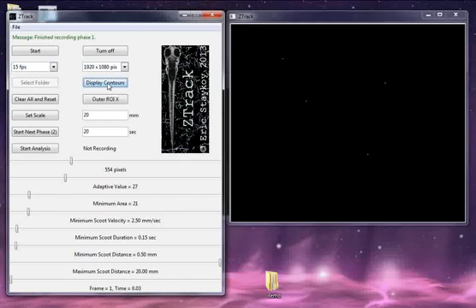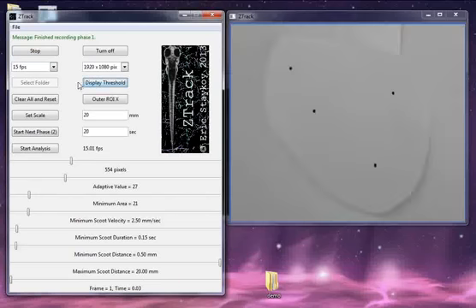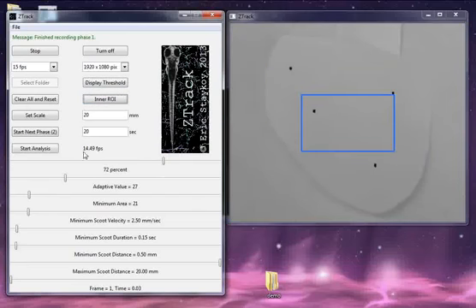Once the recording is finished, you can see a virtual representation of it by using this slider here at the bottom. I just realized that something I didn't show was the inner ROI, which can be used to exclude scoots near the edge of a container because they may be different from normal scoots. Any scoots outside of this rectangle will have a little tag saying that they're outside.